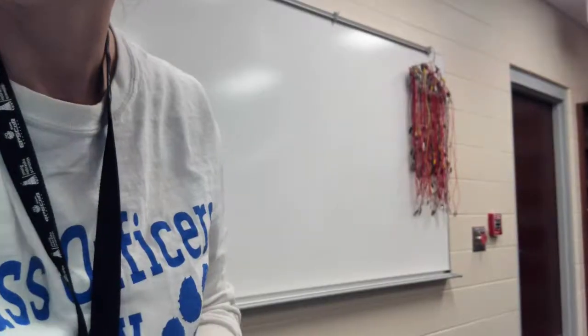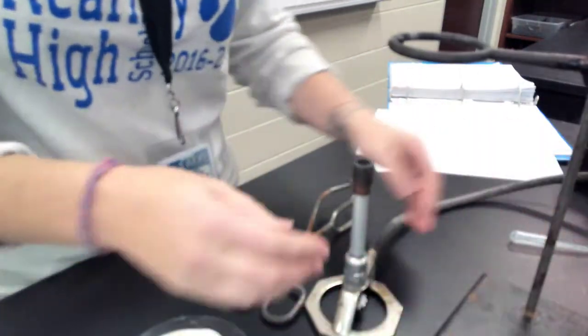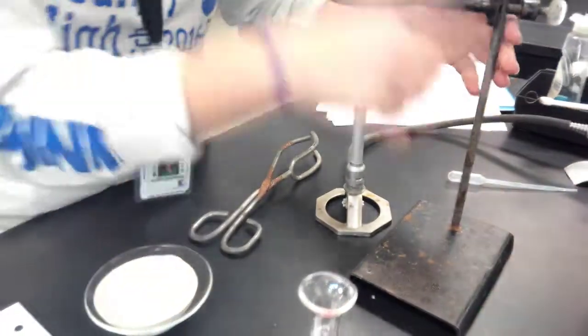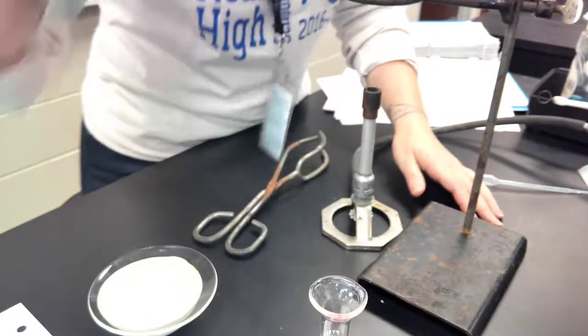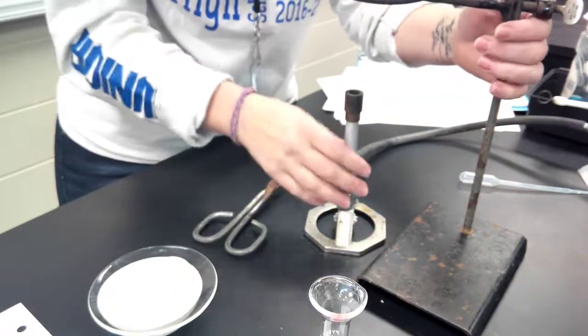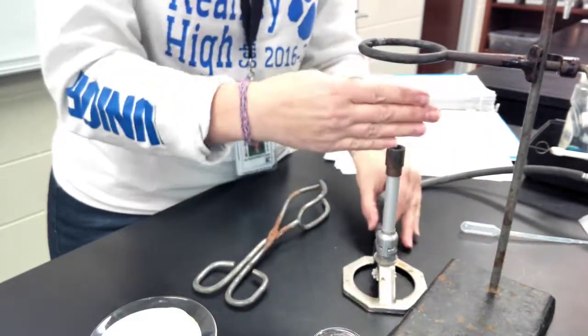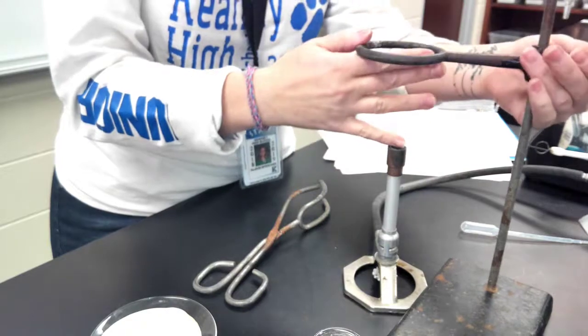Sorry guys, I'm flipping back and forth constantly here. All right, I have my ring stand. I have my Bunsen burner. The most important part of your ring stand is about stability. So if your ring stand and Bunsen burner system are stable with your Bunsen burner on here and it's aligned, then rock on. Mine wasn't, so I set it so that it is set to the side. So it's offset. Four-finger height is the ideal height between these two.